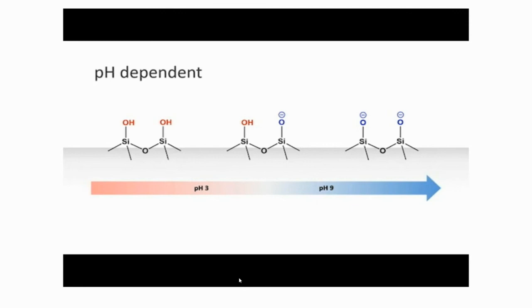In this experiment, the buffer solution we will be using has a pH of 7.7, which is pretty close to pH 9. Therefore, it is safe to assume that the silanol groups on the silica surface are dominantly deprotonated. Because of the deprotonation of the silanol groups on the silica surface, the capillary surface is basically negatively charged. All right, that's why it's negative charge.